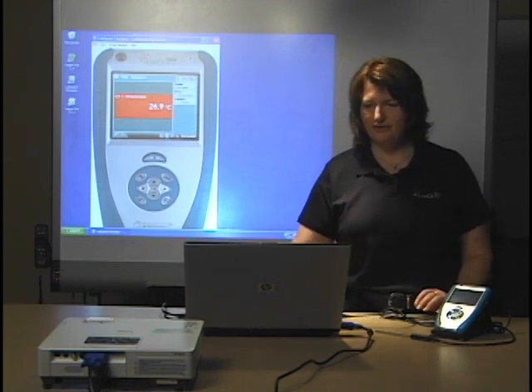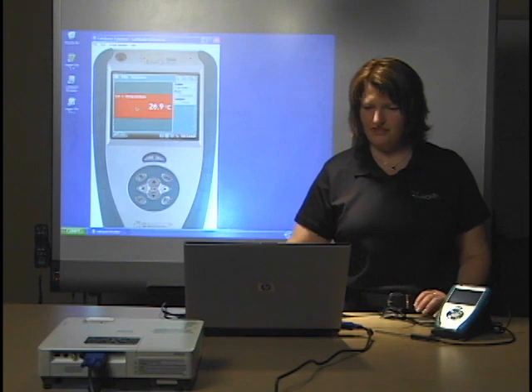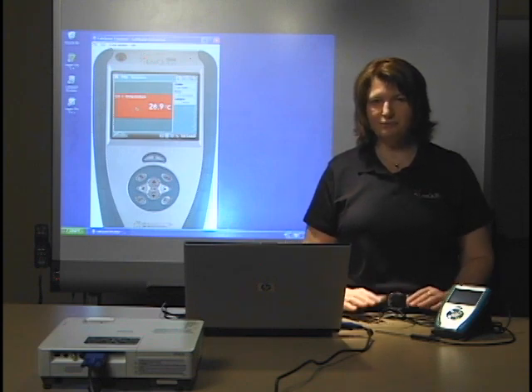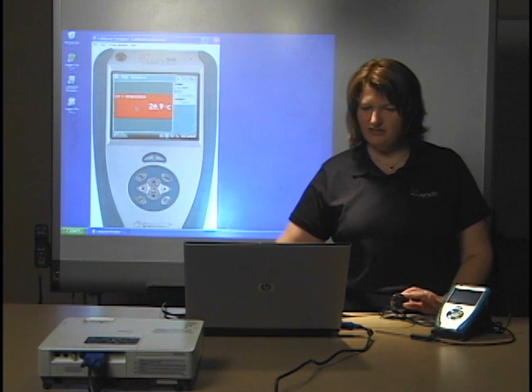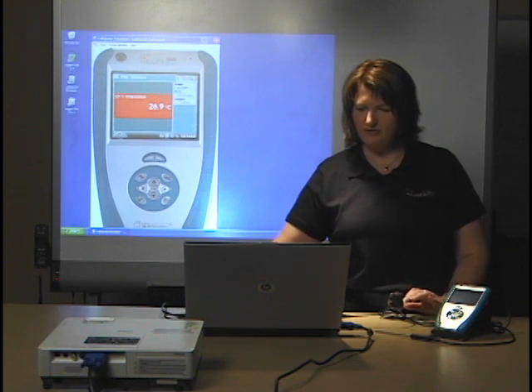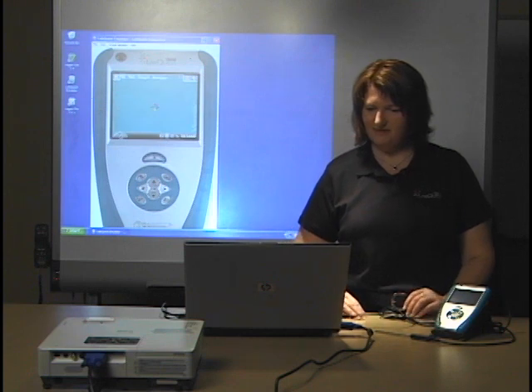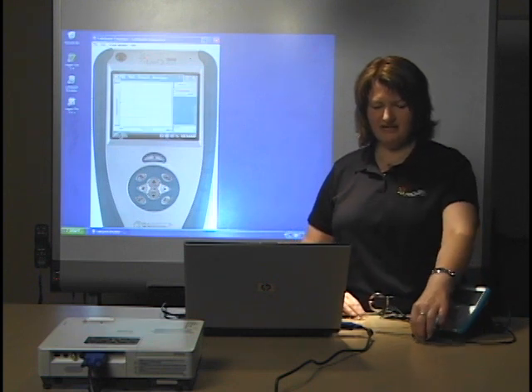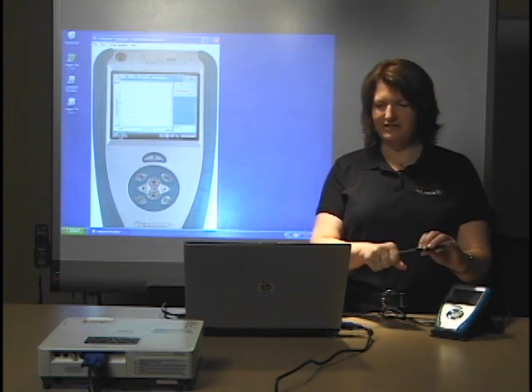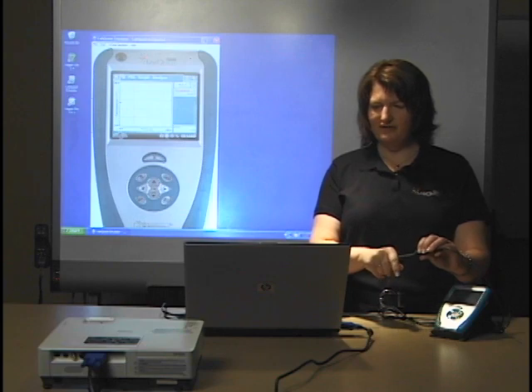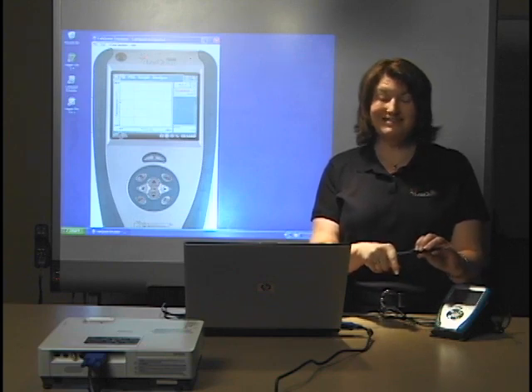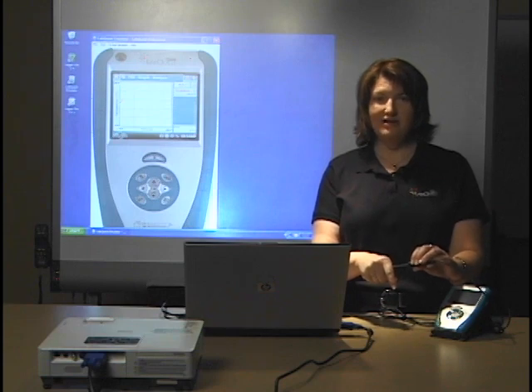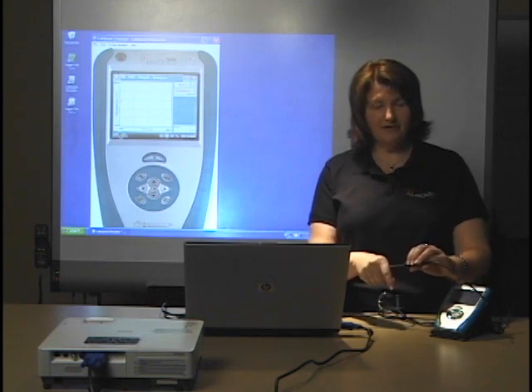You're going to do all your control from the computer with your mouse. Right now I have a temperature probe connected to the actual LabQuest. I'm going to tap on the collect button on the computer and it starts collecting data. I'll put my hand on the temperature probe and you can see the temperature start to rise. It works exactly like the LabQuest unit itself, but it is software running on the computer.